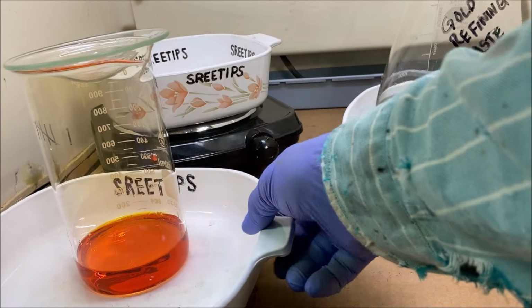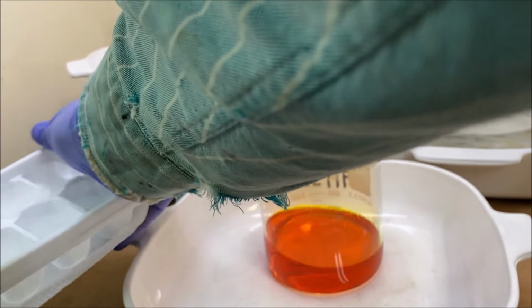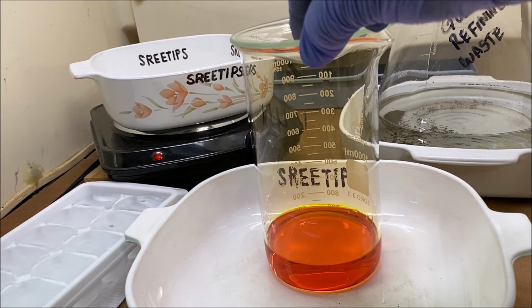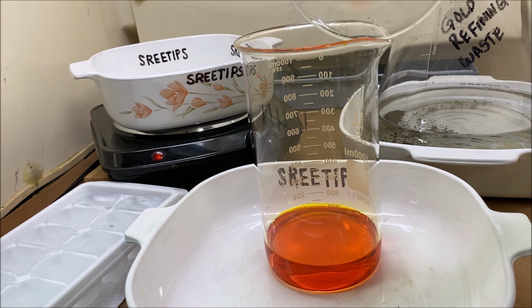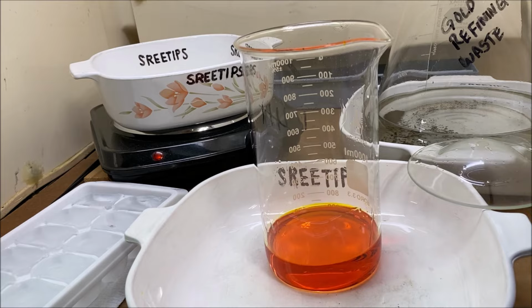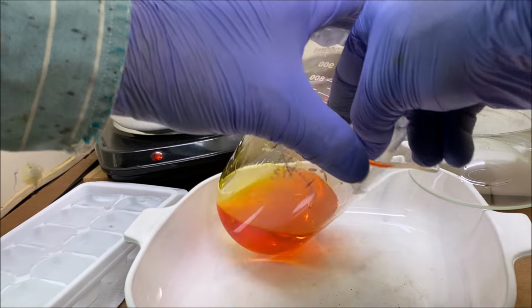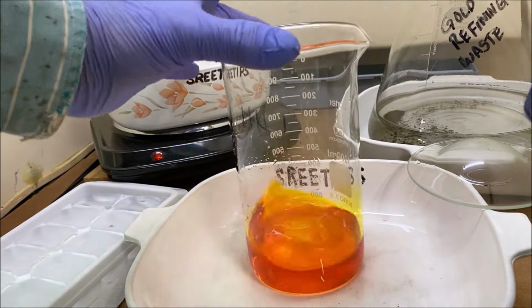Got a little bit of fumage going on in there, not much. So there's probably a little bit of excess nitric in this solution. It's not a big problem. Go ahead and cool this off now with some ice.